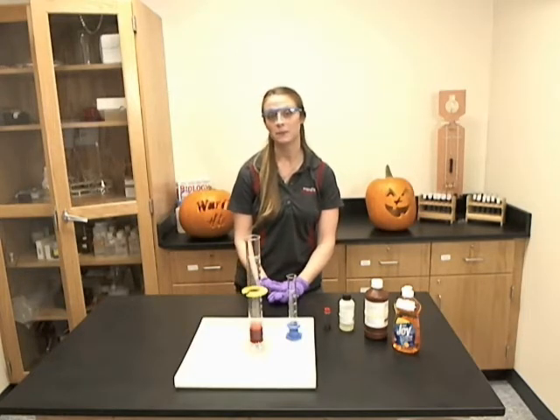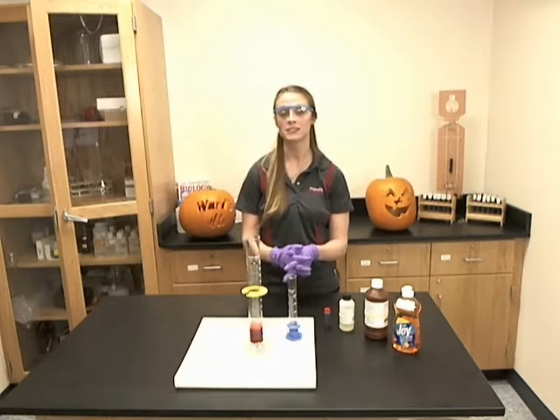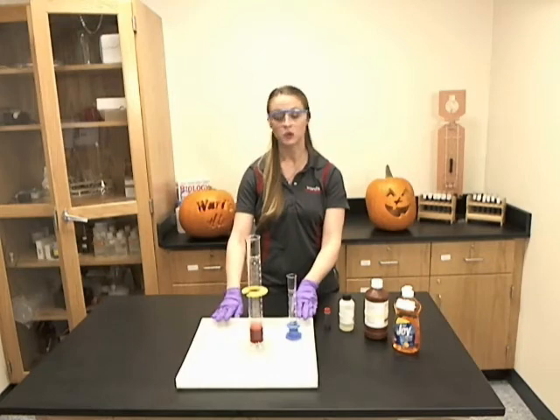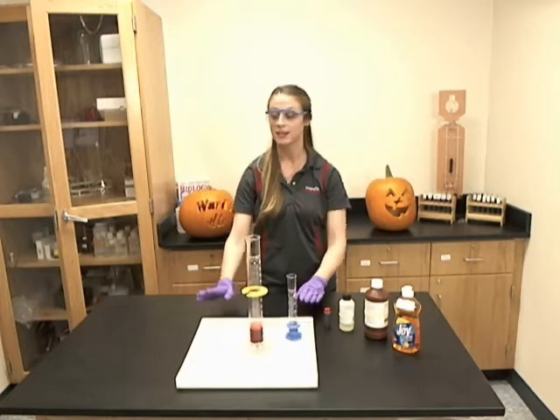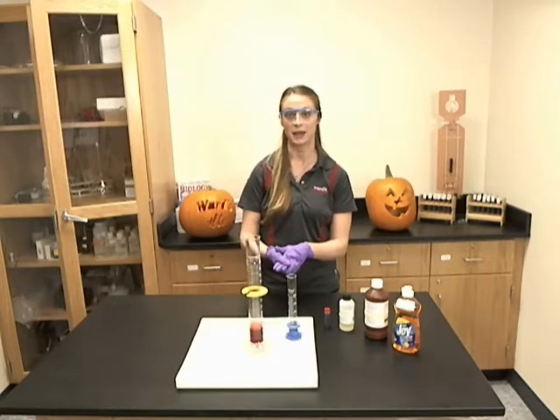One thing to keep in mind is that this is a very dramatic demonstration and it may cause a little bit of a mess, so you may want to have a tray for the reaction to take place in, have paper towels handy, or line your workstation with plastic bags.